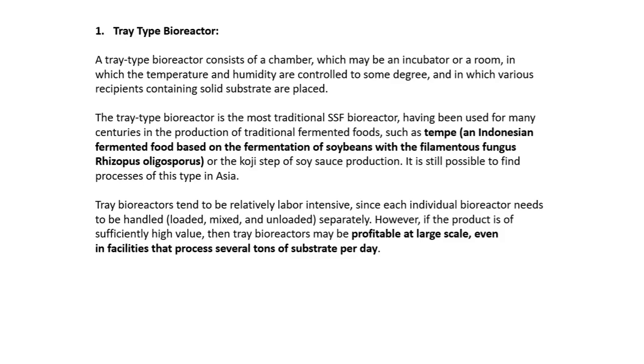However, if the product is of sufficiently high value, then tray bioreactors can be profitable at larger scale, even in facilities where several tons of substrate can be processed per day. Because it's very cheap, there is no further investment; only the manpower is required. There is no need for blowing the air, mixing or agitation, nothing is required for this. The tray bioreactors are very simple, very economical and highly cost effective.